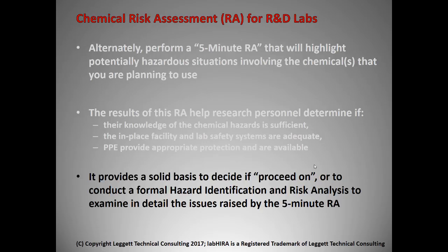This 5-minute RA provides a solid basis for researchers to decide whether it's okay to proceed, or that the hazards are such that either you don't understand them well enough, or you don't believe that, for example, the in-place facility safety systems are up to the task. In other words, a formal hazard identification is now going to be performed to make sure that indeed you're going to end up with a safe environment. Most of the time, you'll proceed on.